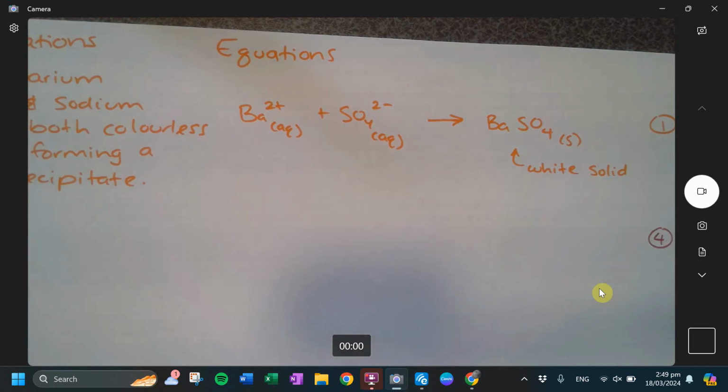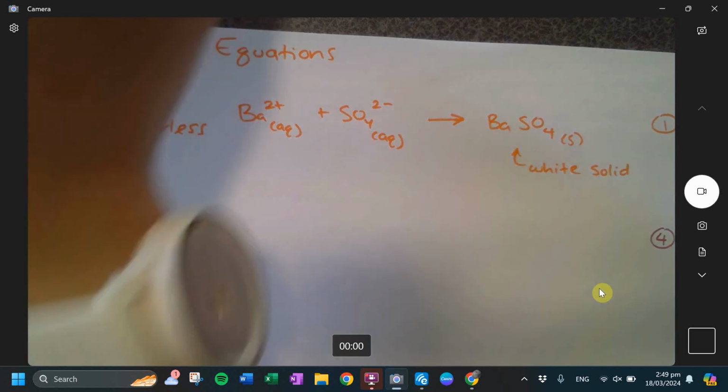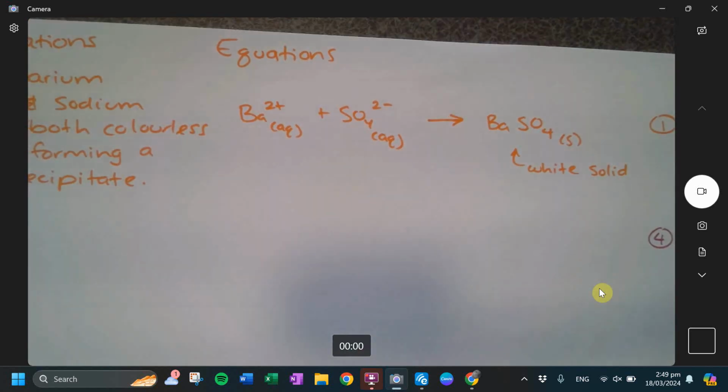Now you guys got to get the ratio right because this one is a little bit more temperamental. Where does it say that? I picked it out of my blue box because I'm looking for aluminium. I'm just looking for an ion that has aluminium in there.